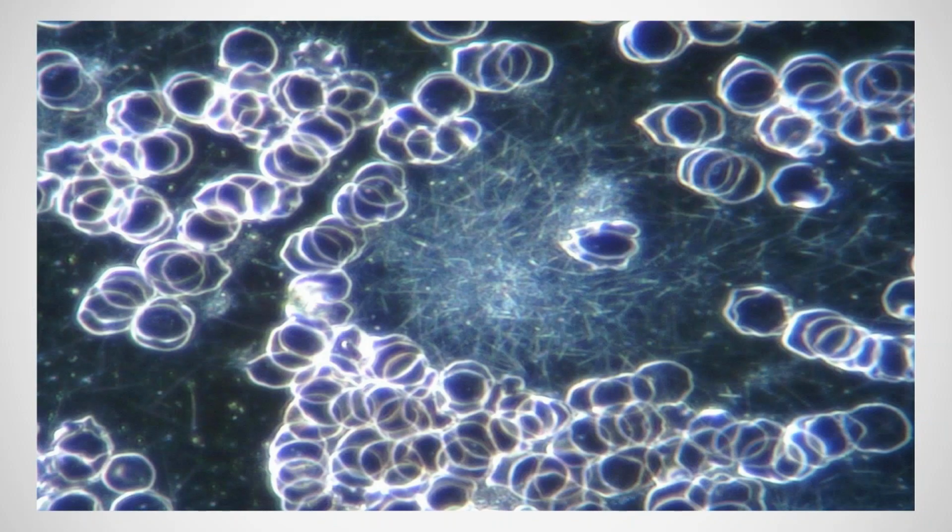All right, so also a live sample here in dark field, and a fairly common finding here, these faint white lines seen here, really concentrated at the center of the image, but we can also see them extending out really throughout the plasma here, and you can see that some of these strands are really quite faint.